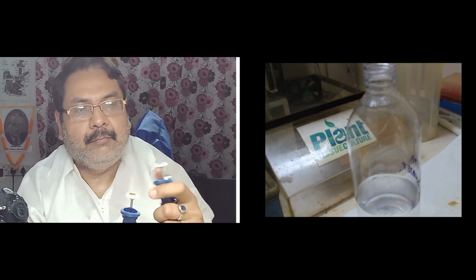This one and the other ones have only one difference: this tip release button is not present over here. This has the push delivery button, the volume plunger, but not the tip release plunger. Others are the same. This knob is the same. The volume changing knob is the same. Everything is the same, but the tip release plunger is not there. So that is the difference between this 1 ml to 5 ml auto pipette and the 1 microliter to 1000 microliter or 10 microliter to 1000 microliter auto pipette. So these are the two differences.